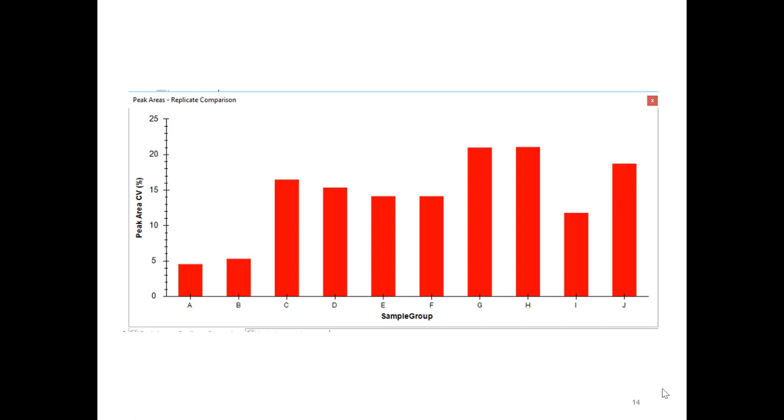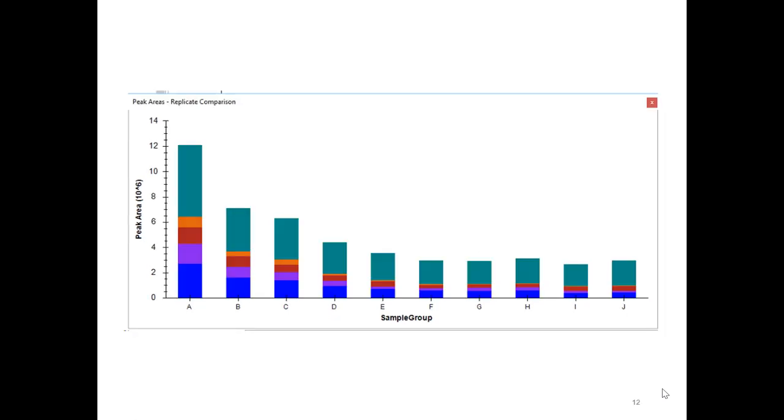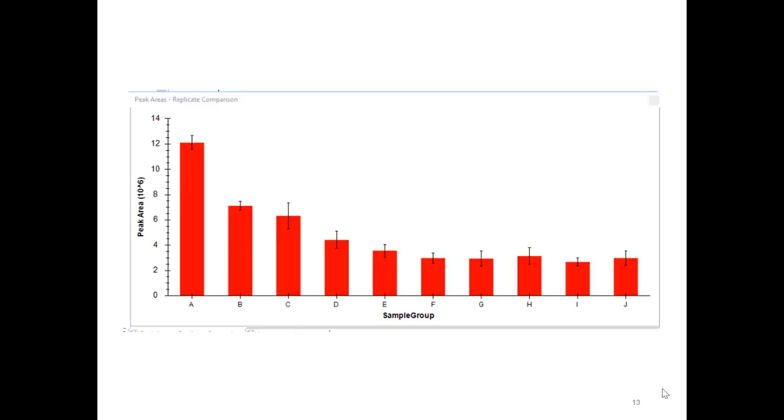I guess I don't understand how the LOQ would be down here when clearly there was a kind of flattening out of the curve up here. I mean, to me, just visually, I would think the LOQ is something like A or B. Oh, really? You put it up here? But I guess that's what the question is. I'm not sure how you get. So the problem is that the scale is categorical. Yeah, that's a good point. So they're saying categorical. My sample groups here are labeled with letters. These are just categories.